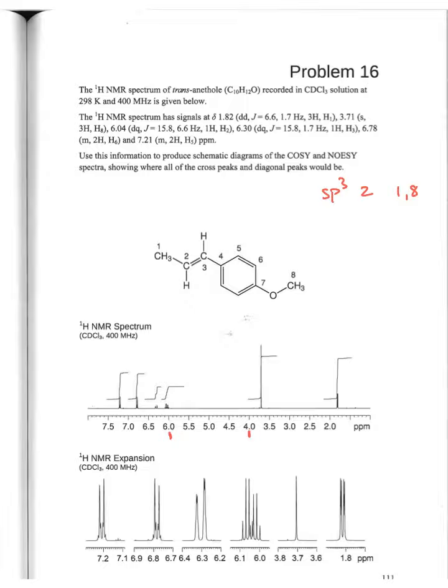This thing at 1 is that one right there. That most resembles, and whether you believe this or not, or it's not evident, maybe by the end of the semester it will be, or at some point a light will turn on. If I write this, so this is methane, CH4.